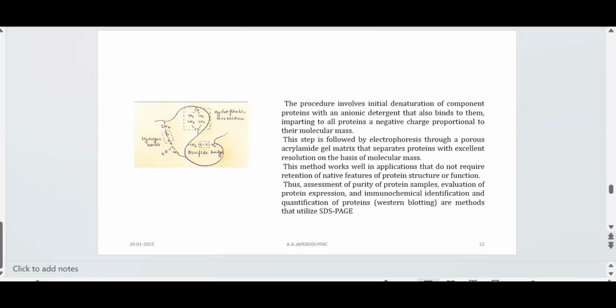So this is the case when you are talking about a protein having a single polypeptide. Against that, here I'm talking about not one but multiple polypeptides, and the molecule is oligomeric. Now, when you have to do protein analysis of such an oligomeric protein, the whole structure, as I said earlier, is stabilized by hydrogen bonds, disulfide bridges, or maybe hydrophobic interactions, right?